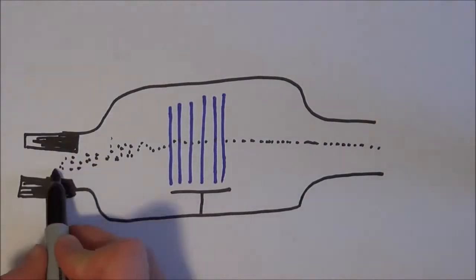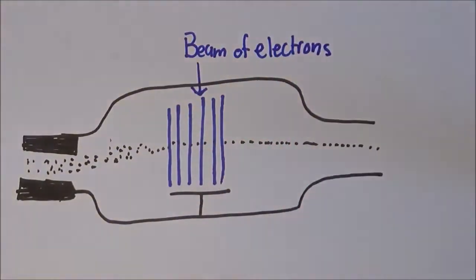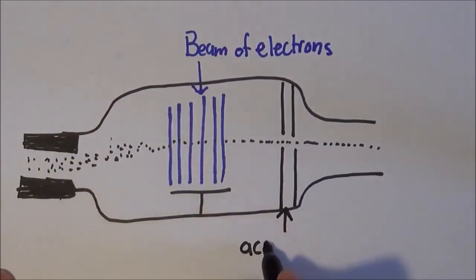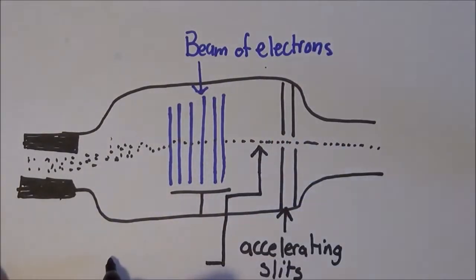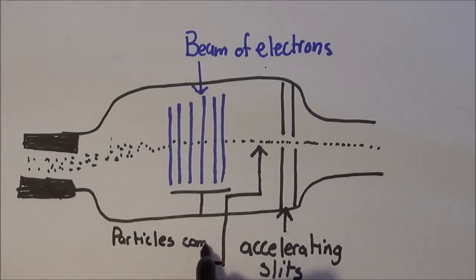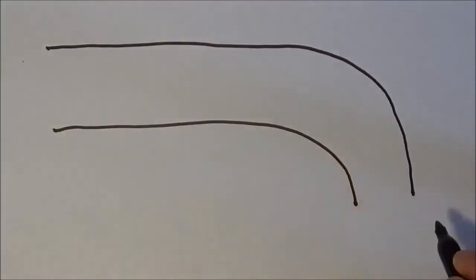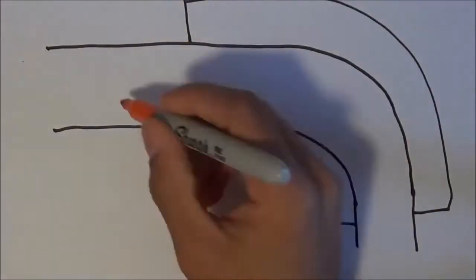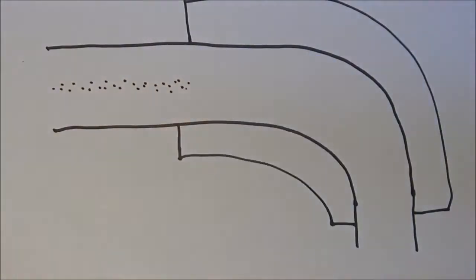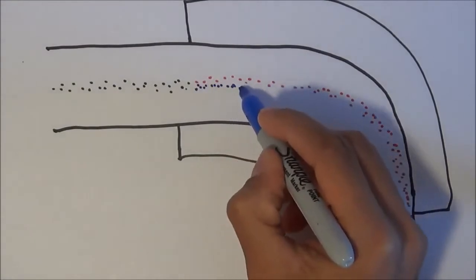As soon as they become positively charged, the positively charged compound repels the highly positive core of the electrostatic accelerator, and all the projectiles shoot out of the small opening. They continue in a straight line and are deflected by the electromagnet. After deflection, the particles hit a sensor. Depending on where each particle hits the sensor, which is a silicon barrier, it is given a mass-to-charge ratio that can then be used to determine each particle's mass.